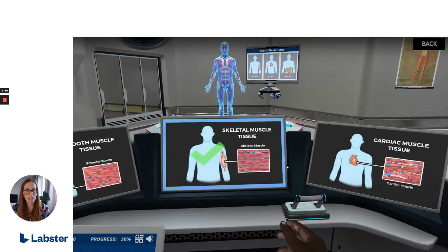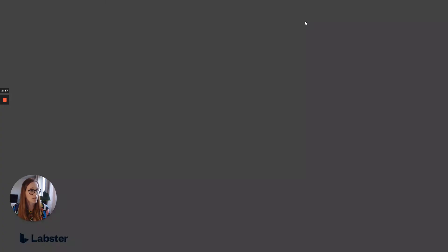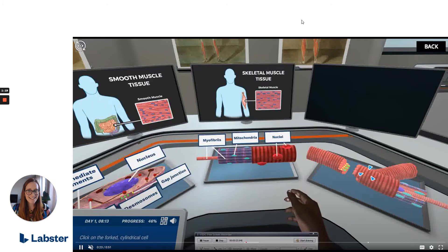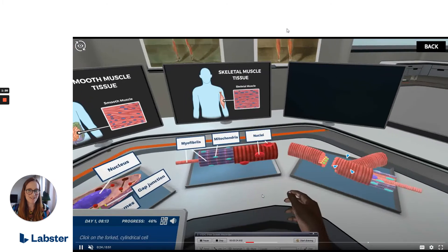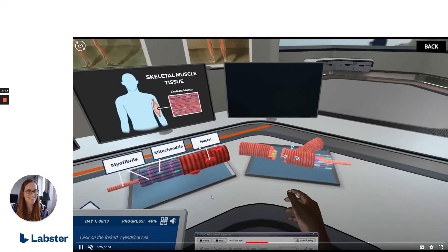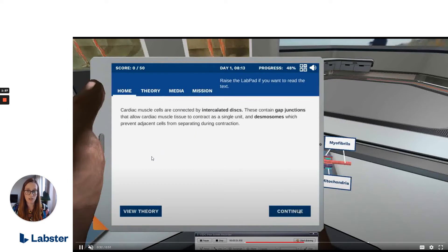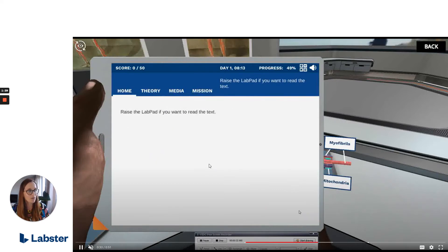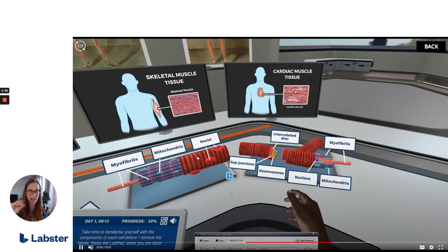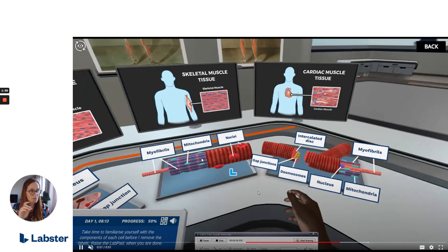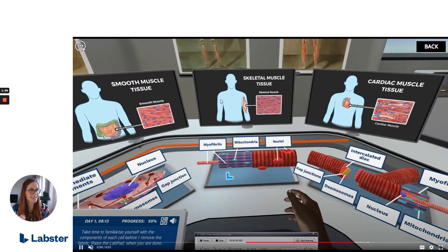The negative feedback is triggered when a form is filled incorrectly or the wrong option is selected. We also added new images for each of those muscle cells, labeled their parts, and fixed the performance issues associated with that workstation. Now users can rotate the cells and explore those models in more detail.